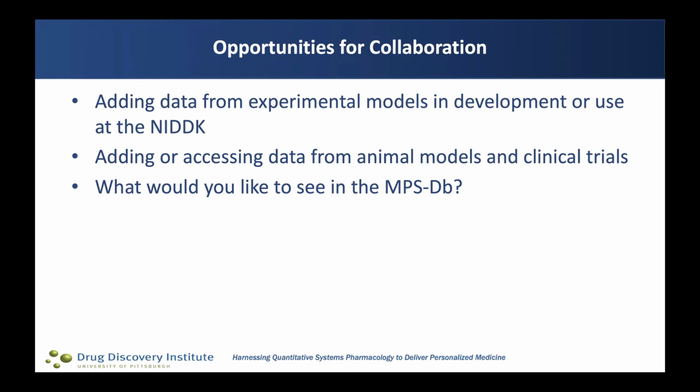And then just as a general question, what would you all like to see in the MPS database? What could we do to make it more useful to you? So with that, I'll leave it to the question and answer session.